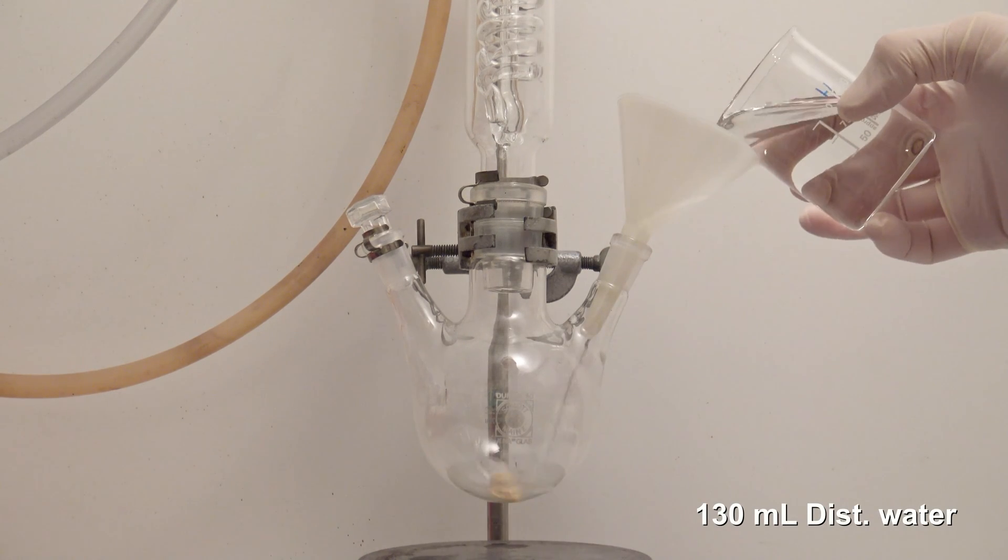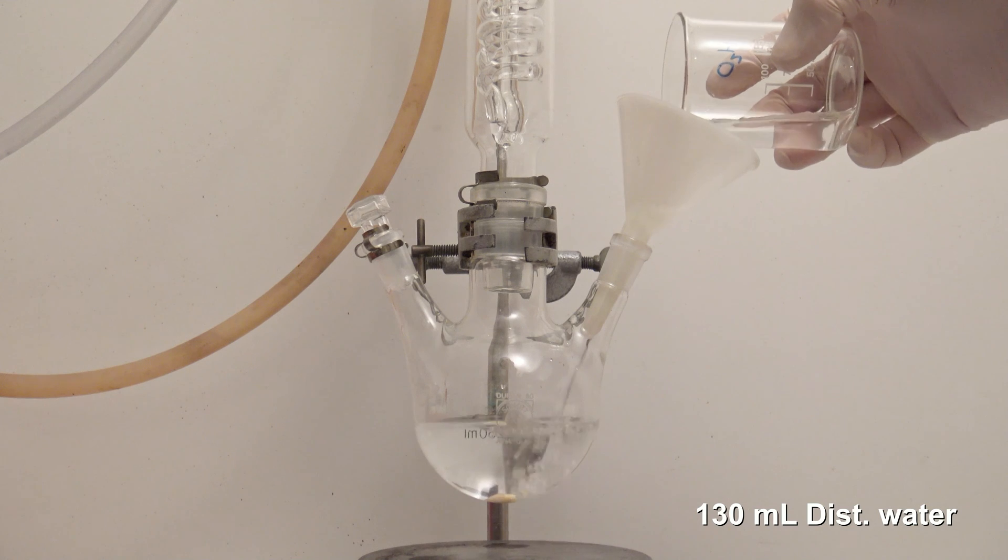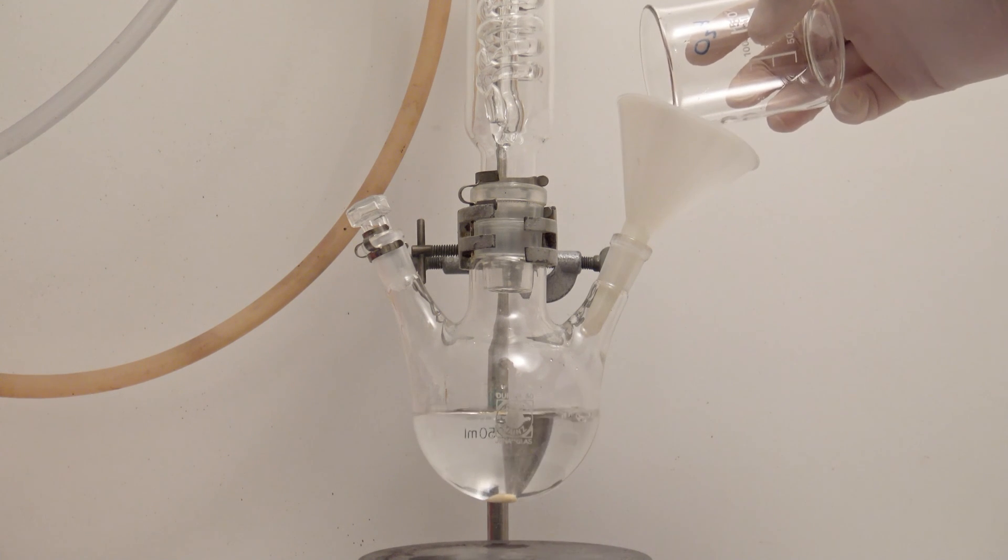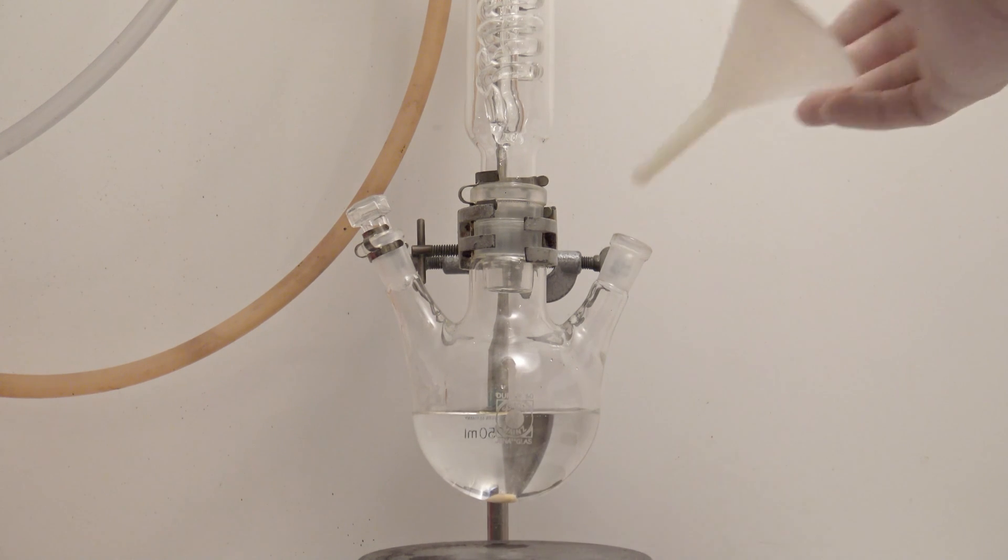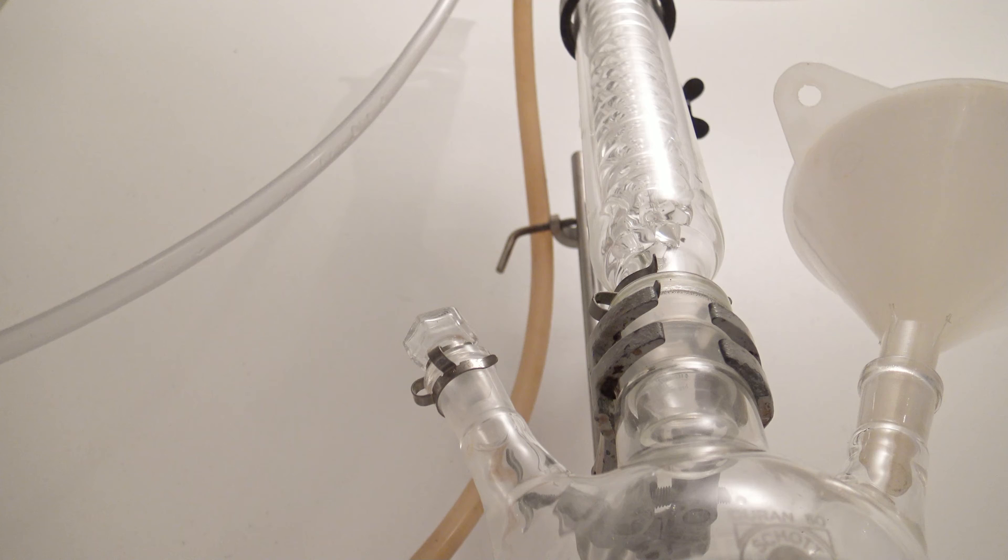First, 130 ml of distilled water were added to the flask. Before the next step, the pump for the cooling water was turned on to make sure that vapors could condense if needed.